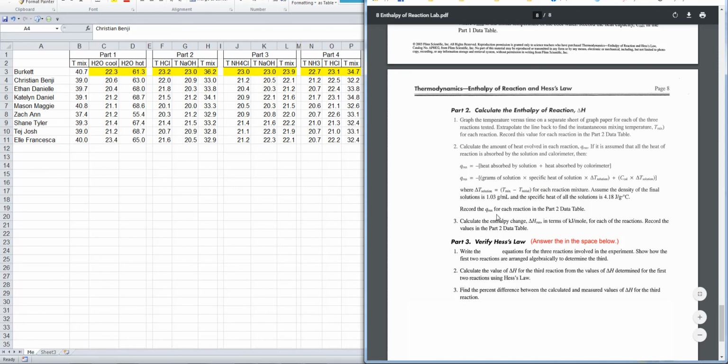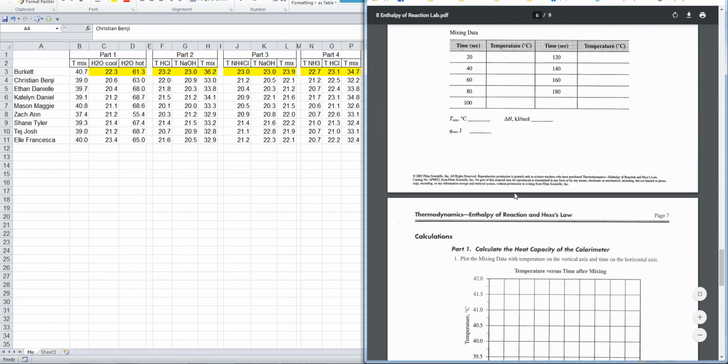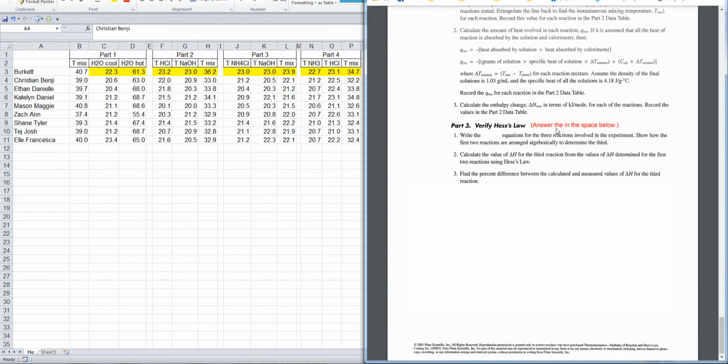It will tell you how to get Q reaction, and it'll tell you how to get delta H reaction. So you're not really doing the calculations here. Either do them here in the margins or put them on a separate sheet of paper, doesn't matter to me. And then lastly, if you're doing stuff in the margins, where it says answer in the space below, just do this probably on the same sheet that you're doing your pre-lab questions.